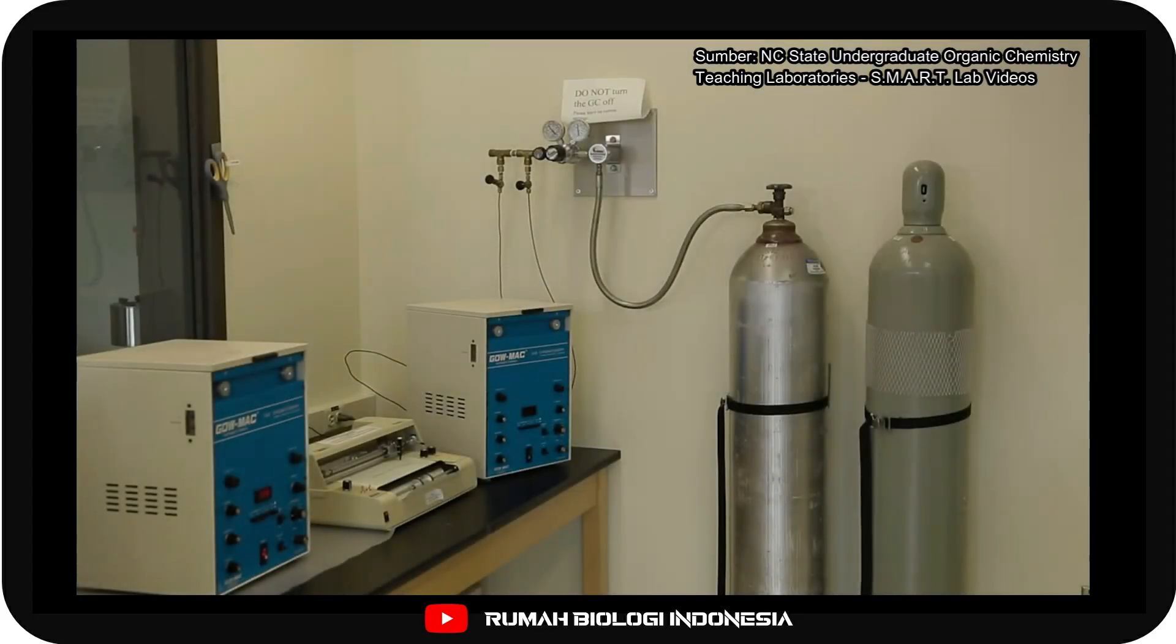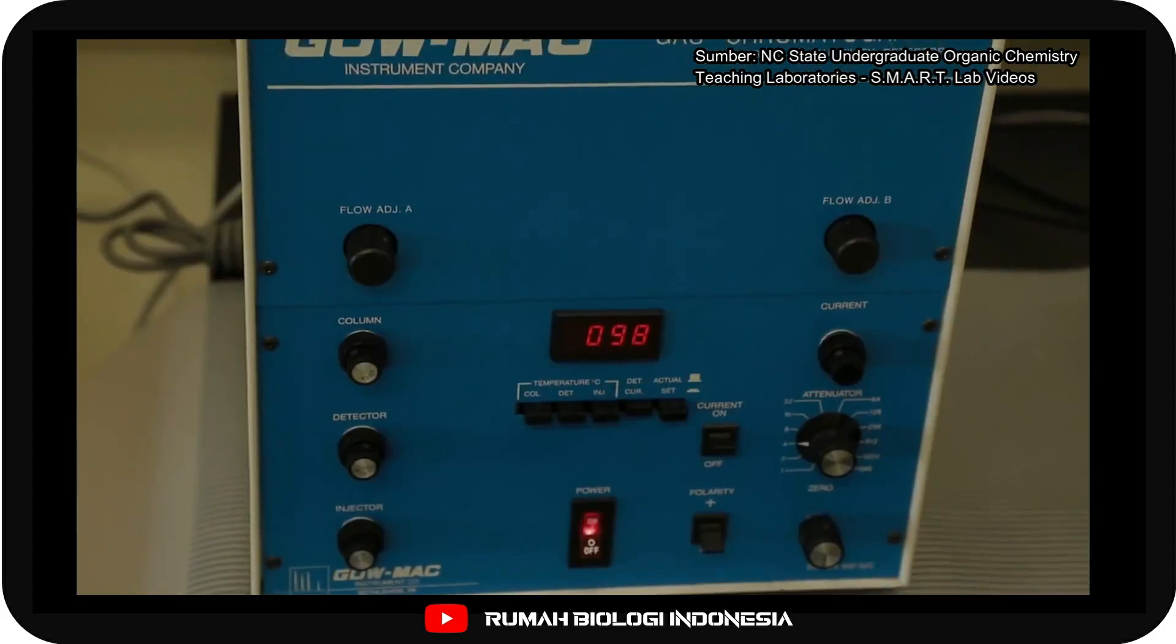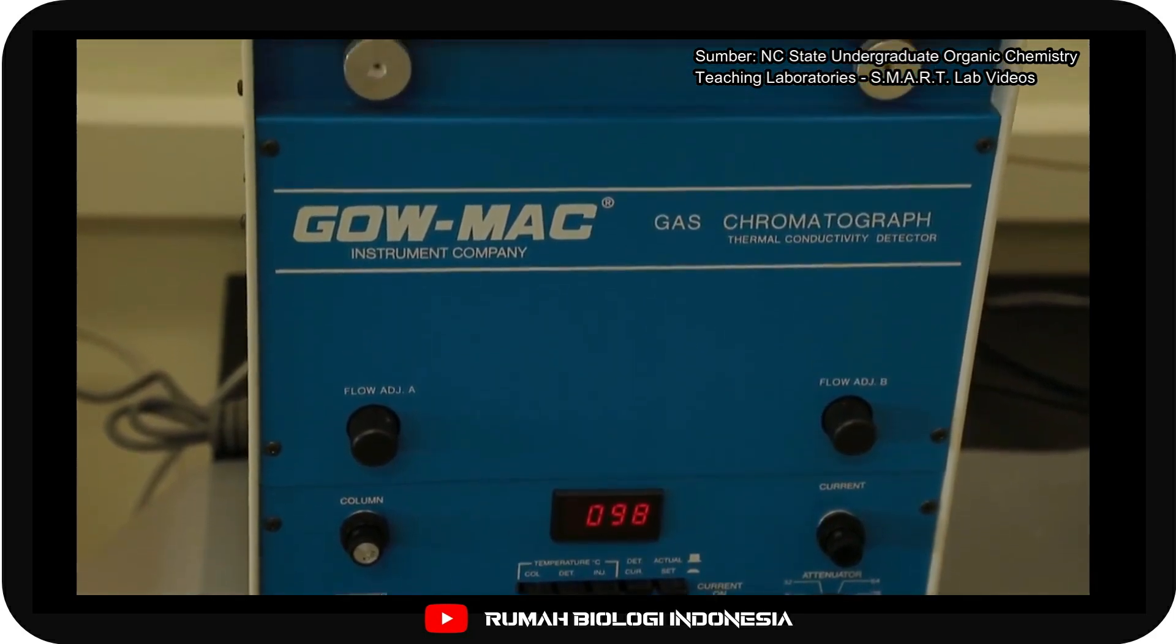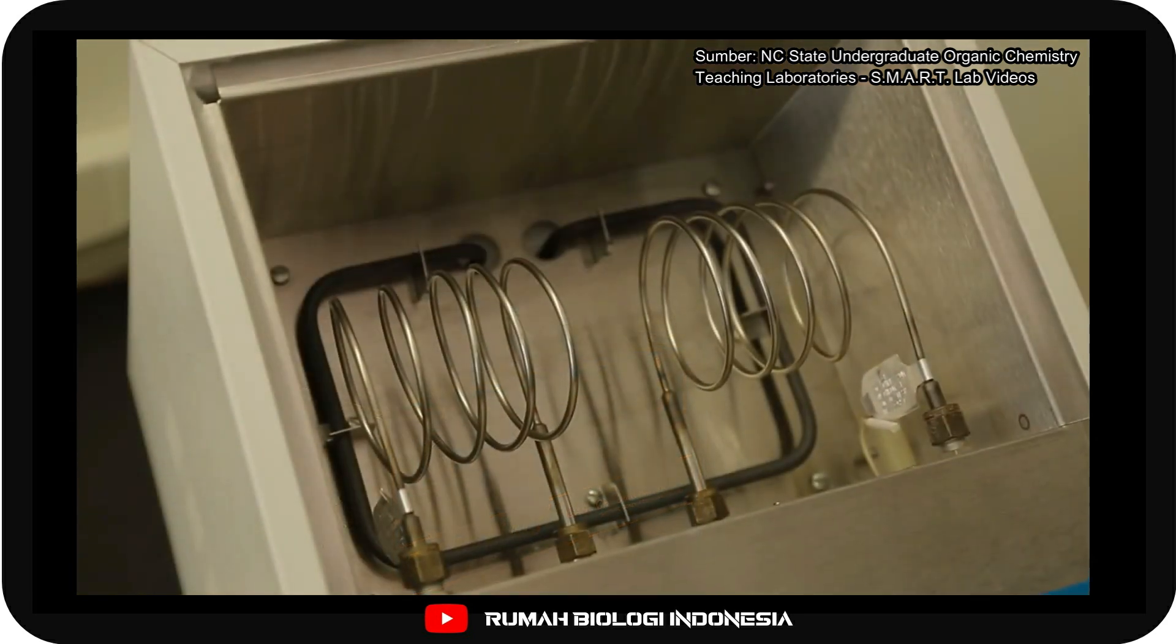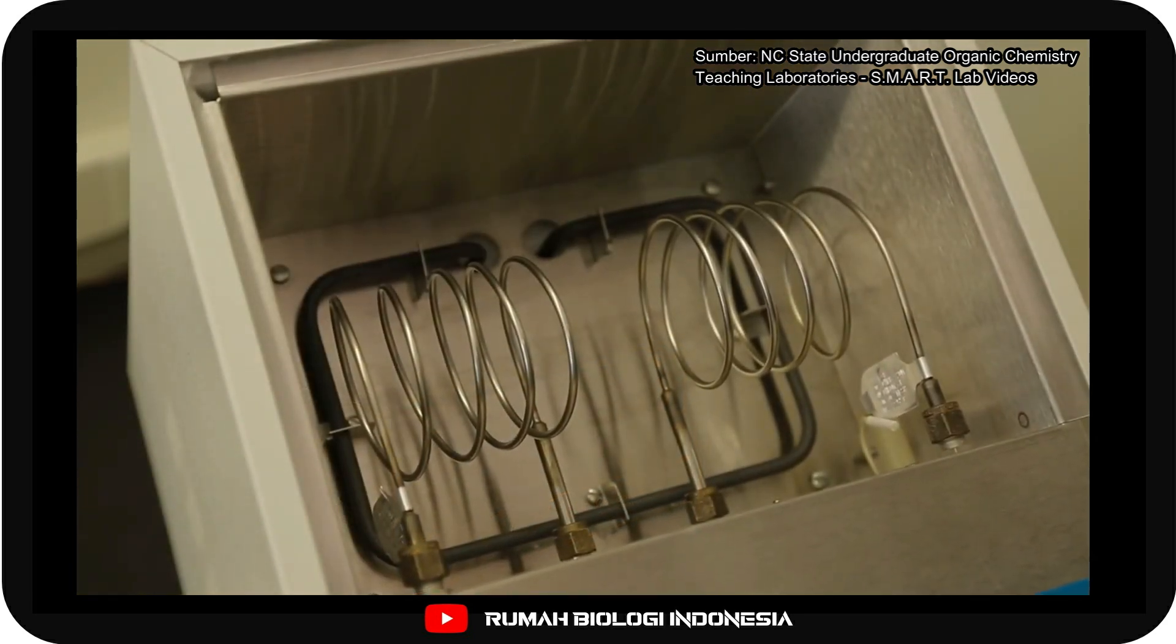To perform gas chromatography, often called GC, we use a gas chromatograph. A gas chromatograph is an instrument with a long column filled with small particles coated with a very thin layer of an adsorbent. This layer is the stationary phase of the column.